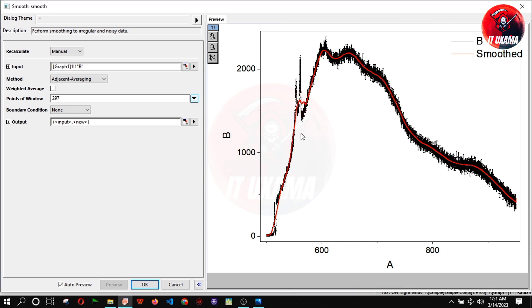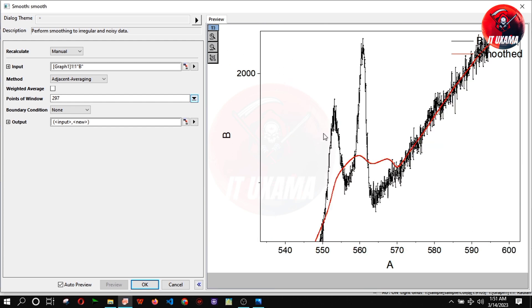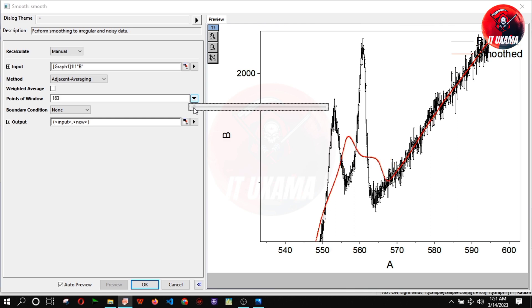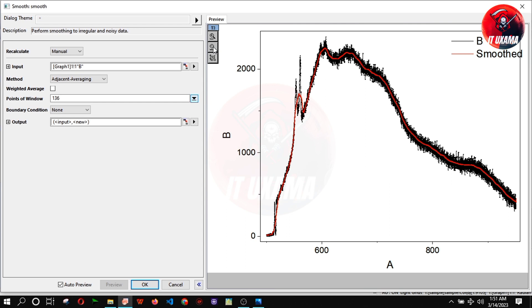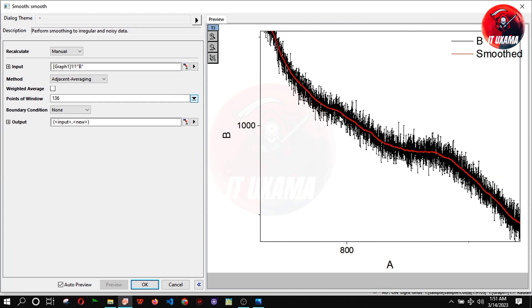Zoom into small peaks and change points of window until a smooth curve is obtained. Now you can see curve is fitted very well and variations and data points are removed. Press ok.